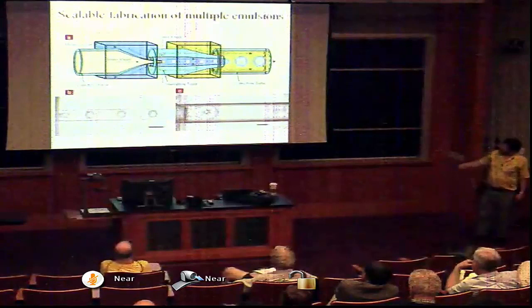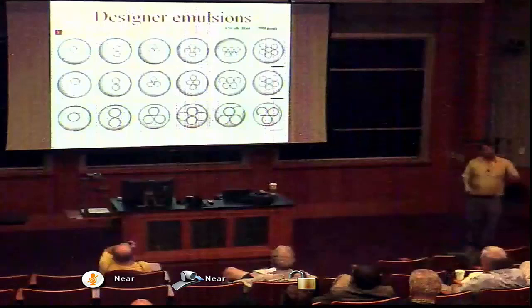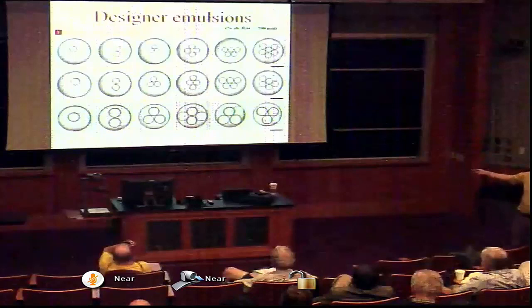Now you have really very good control. And so now you can make what I call designer emulsions. You can make any number of drops that you want. And so I say, well, how many drops do you want on the inside? You say five. Well, I say, what size do you want? See, here's five. I can change both the number and the size very easily.